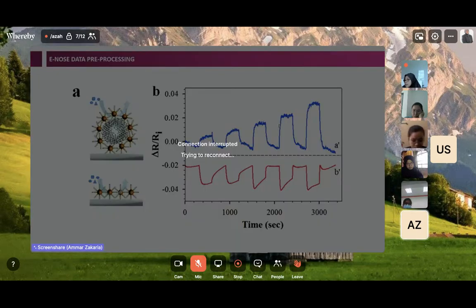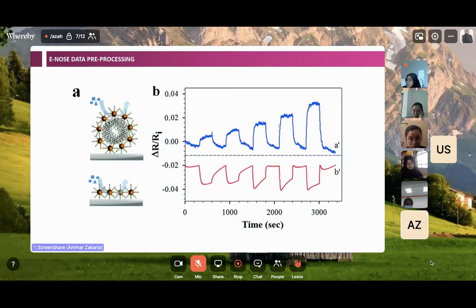What is really happening here, right? What do you think is happening here? This is happening purely because you don't really control the ambient temperature. You do it in the morning, and after a while, the ambient lab temperature increases slightly by 1 degree, and the changes in the temperature will give you this effect.